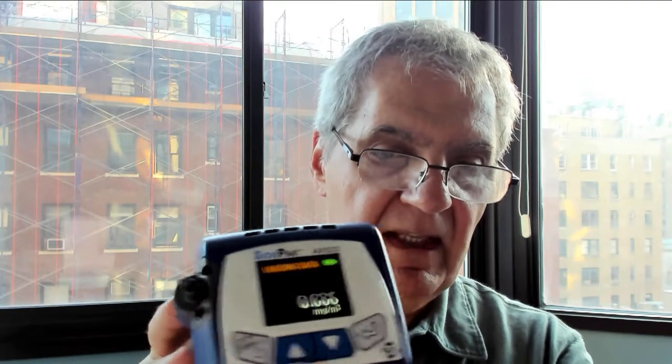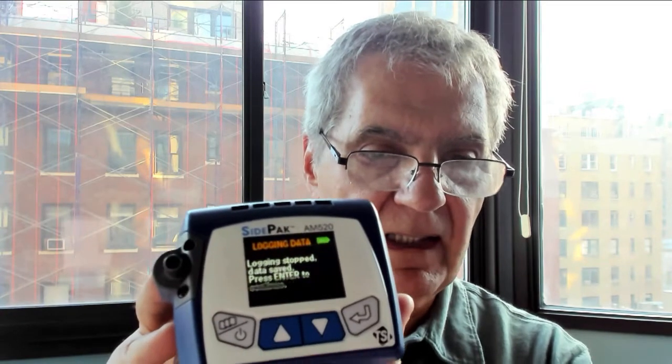You can see it continues to tell you it's logging data. If you want to stop logging, hit the on/off button and then hit enter — that button right there — and you have now stopped logging. Don't forget to start and stop the logging, otherwise you won't be able to download the data. The readings are pretty standard for this so you don't really need to do much more.